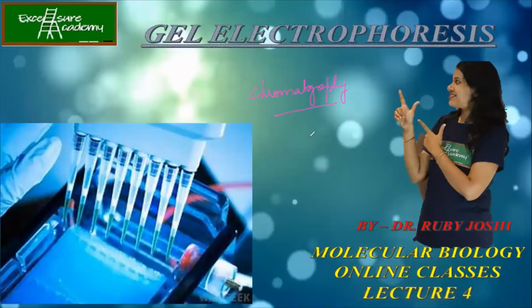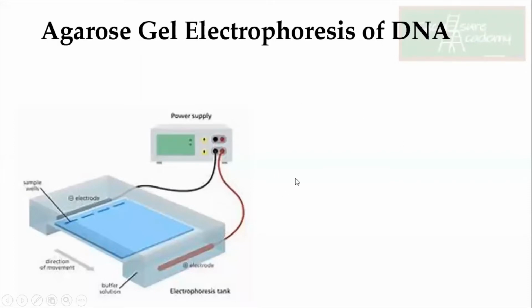So first, we have discussed how DNA and RNA are purified. Now we'll study gel electrophoresis, in which Agarose Gel Electrophoresis, we'll be talking about the visualization of DNA and of course RNA also. So this is how your apparatus looks. I'm sure you must have seen your Agarose gel electrophoresis in your lab. This gel electrophoresis is horizontal.